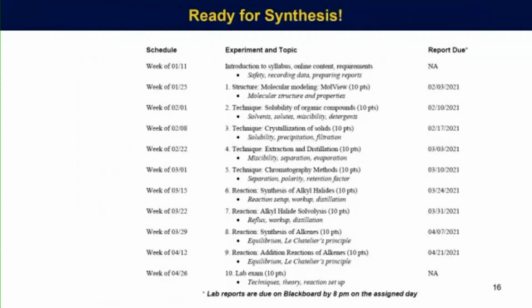At the end of the first term, we're ready for synthesis. We are thinking now about doing the SN1, the SN2, the E1, the E2. I'll talk about reports in a second. I do have reports coming up. Somebody's asked a question about reports. These are classic reactions that are done in the first semester at the end to get students ready for the second semester. So we wanted to do them in the lab.